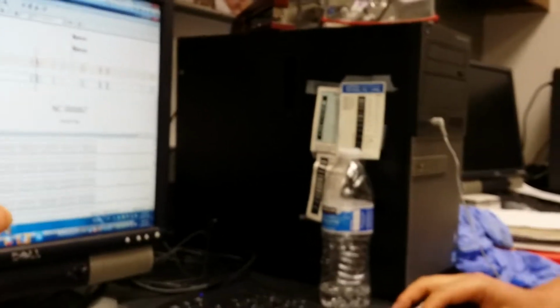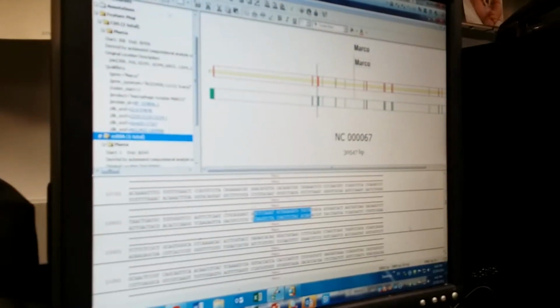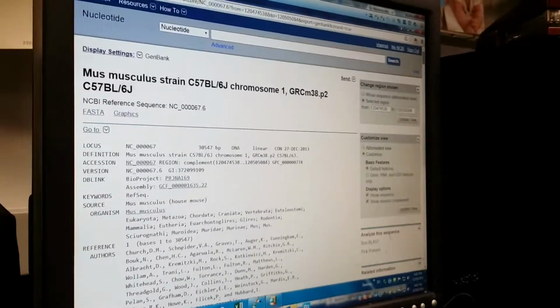And can you blast it? What about, say, you get something that you think is good and you see if it's anywhere else? Can you do that? If we have the target sequence, two target sequences, then we can blast. Can you do that real quick? Because you're good at this. Let's do it. We just found one side, and see how often that thing plus the intervening sequence comes out. Let's say this is a target sequence. I just assume it's not, but okay, I understand.